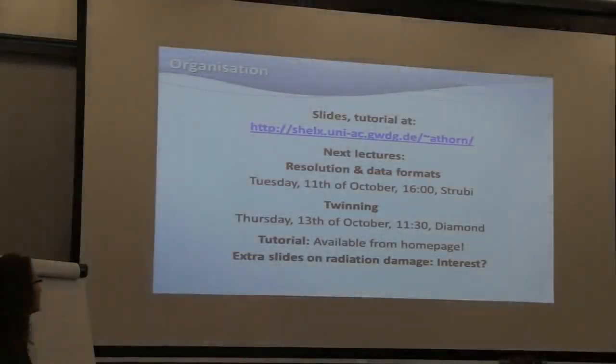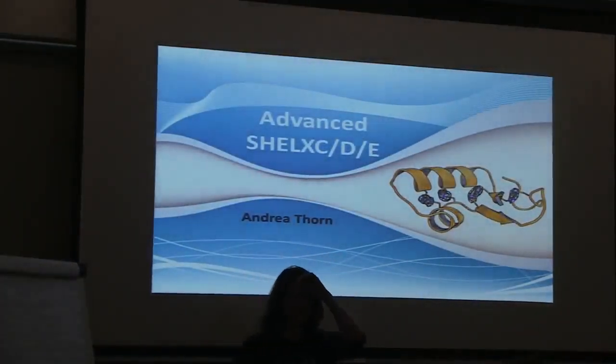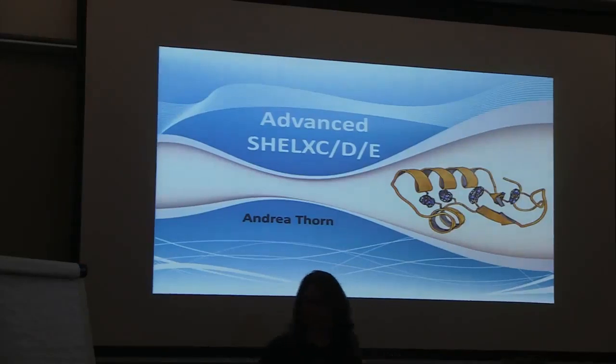Today I am going to talk about advanced SHELXC, D, E. So this is a talk that is going to deal with advanced experimental phasing.